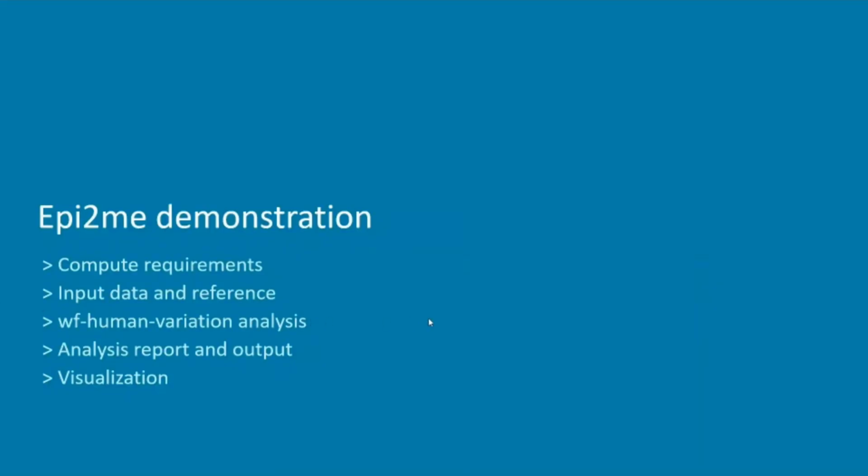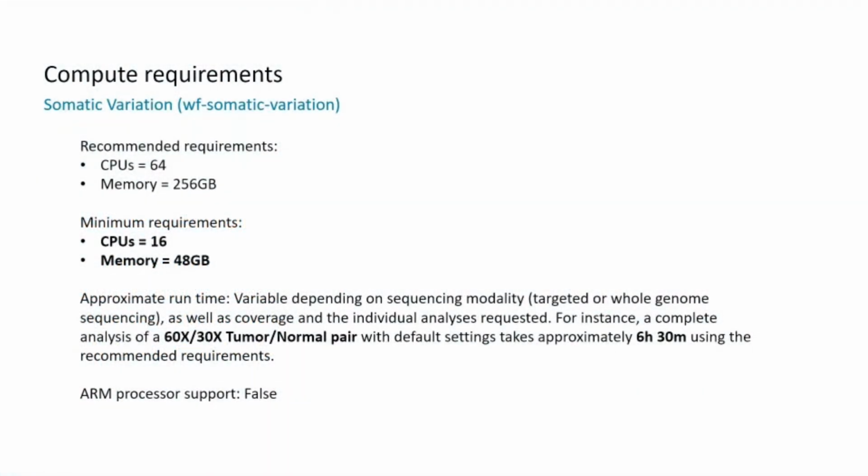So from here, before I start the EPI2ME app demonstration, I just want to walk you through some of the details for the demonstrations, because during the demonstration I might not be able to show you some of the information visually.